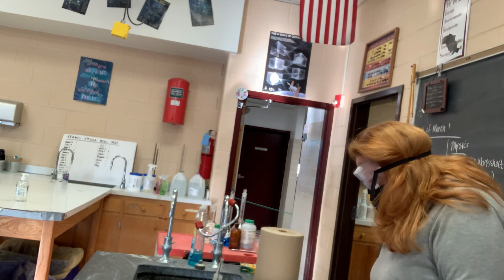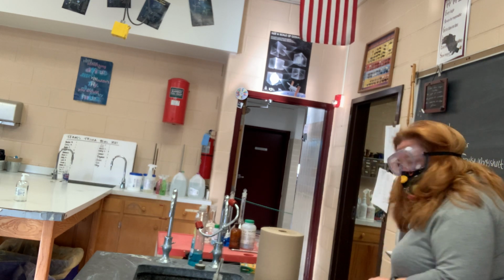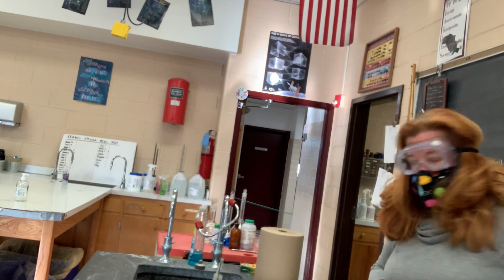What we're going to do for this one, it says to get a clean, dried test tube in the test tube rack.